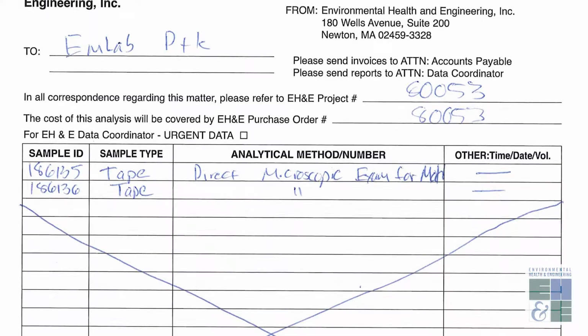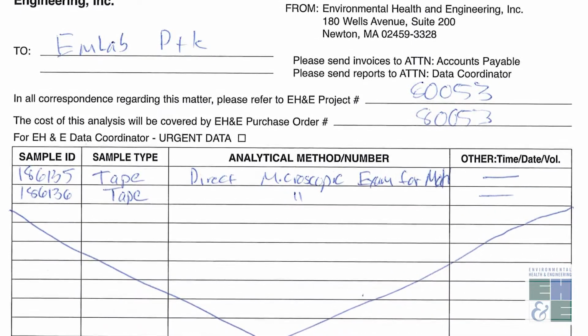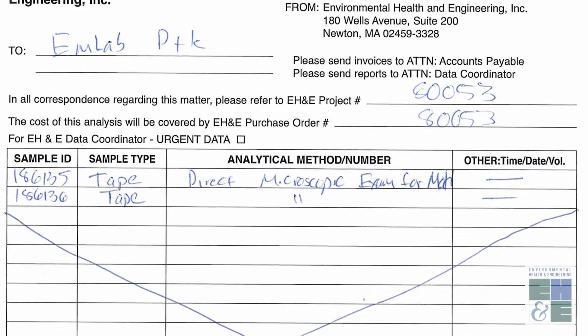On the chain of custody, we have 4 fields that need to be filled out. The first one is sample ID. Each sample should have a unique ID. Sample type. In this case, the sample type is tape sample. So I'll say tape. Analytical method number. In this case, I'm going to say direct microscopic exam for mold.